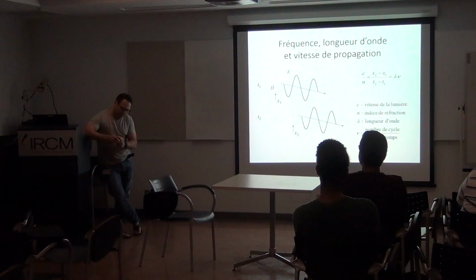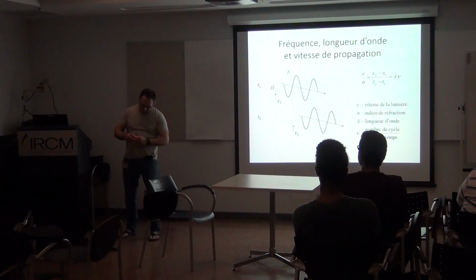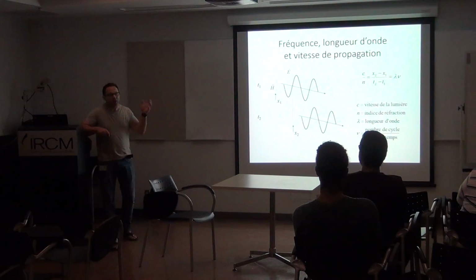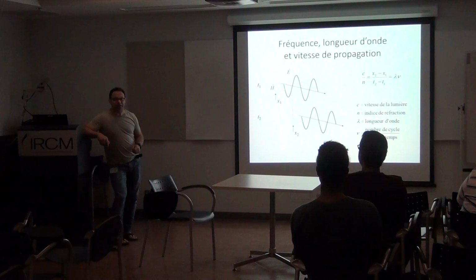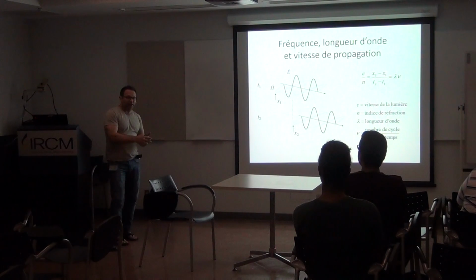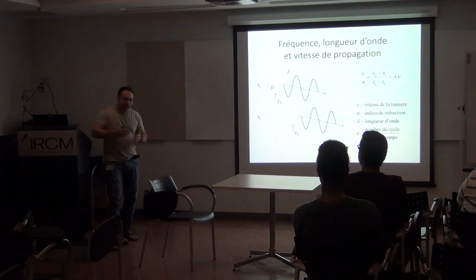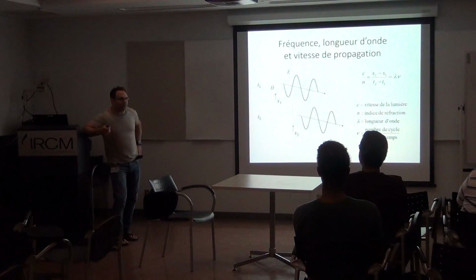And this is also why, so it's good that it's a red pointer because it goes through my finger, but if it was white, it would be also red, since it's only the red part that go through. So infrared are really translucent, they are not absorbed by living thing. And that's why we will use those a lot when we use probes. So we will shoot some red light and take out the infrared, and so it penetrates well and is also well detected.